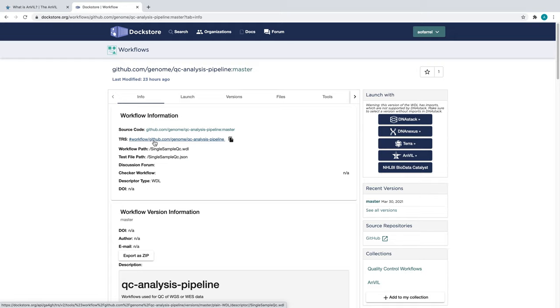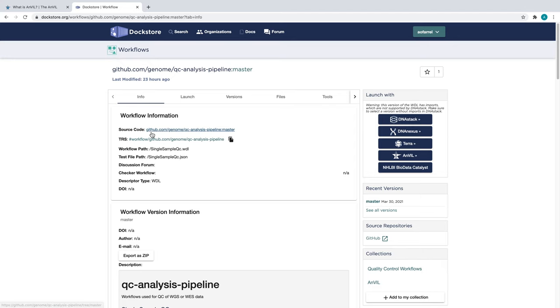On the Information tab, we have an overview of the workflow. At the top, we can see a link to the source code of the pipeline. In this case, it's hosted on GitHub.